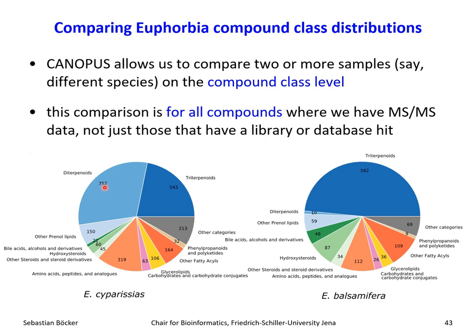Really, 10% might be annotated or maybe not. But we can tell you for sure that the other ones are also diterpenoids. I don't know if this already triggers something and you say, oh, this is interesting, there must be something going on. But as I said, maybe this is enough information.